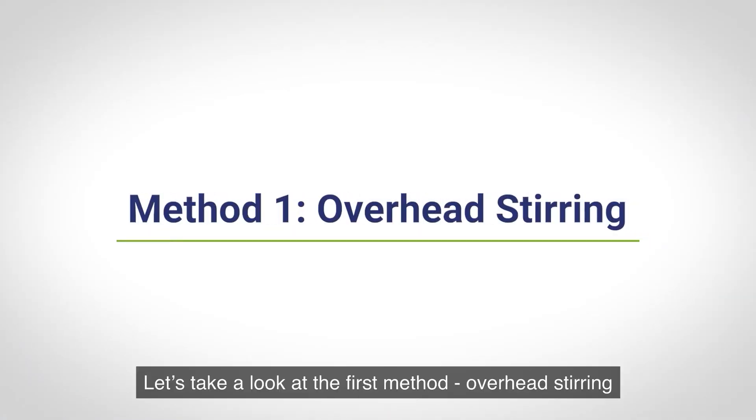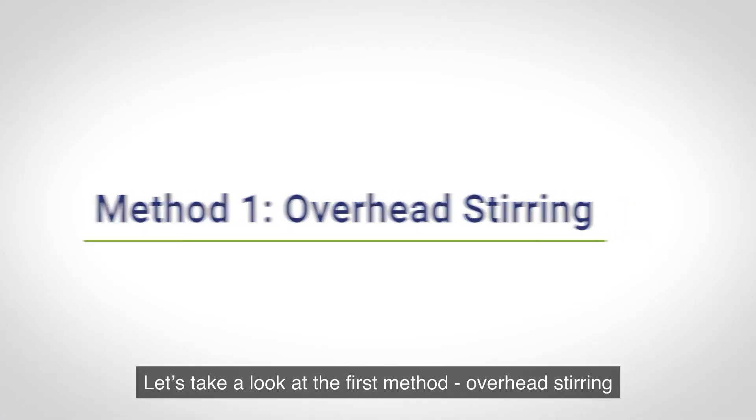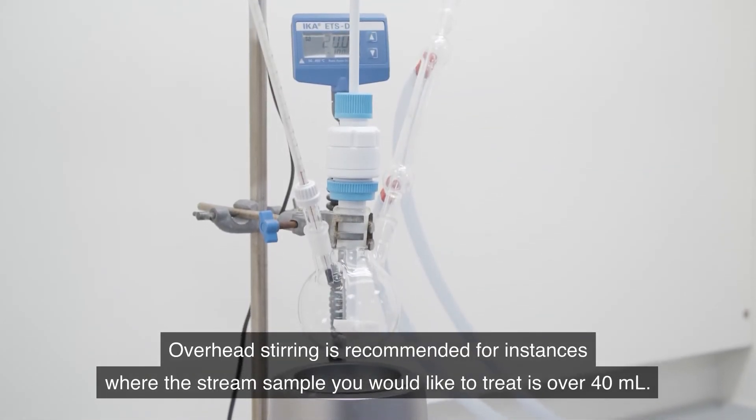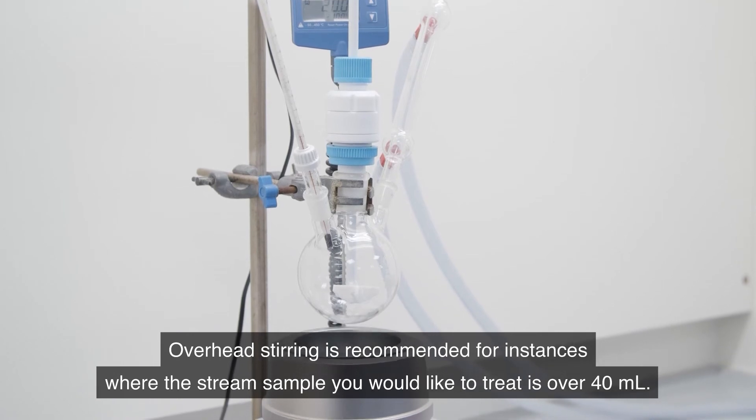Let's take a look at the first method. Overhead stirring. Overhead stirring is recommended for instance where the stream sample you would like to treat is over 40 mils.